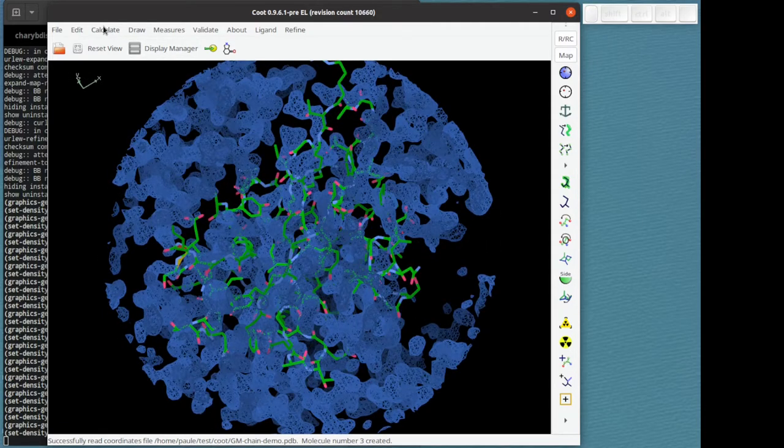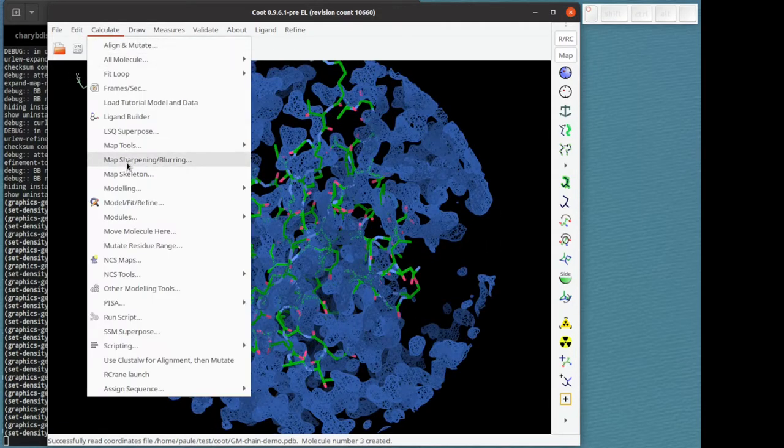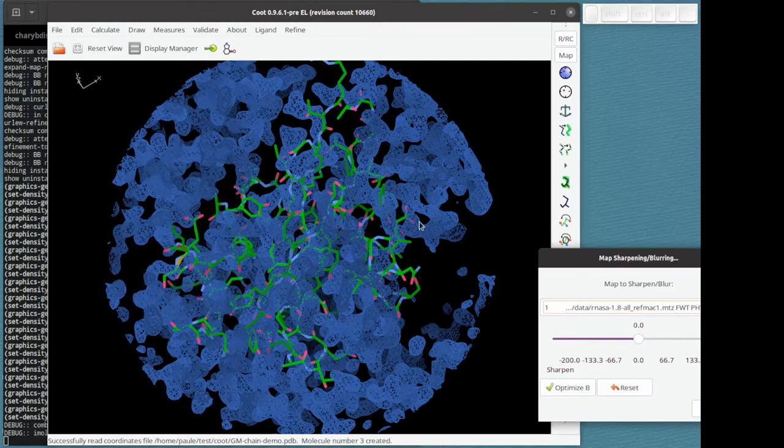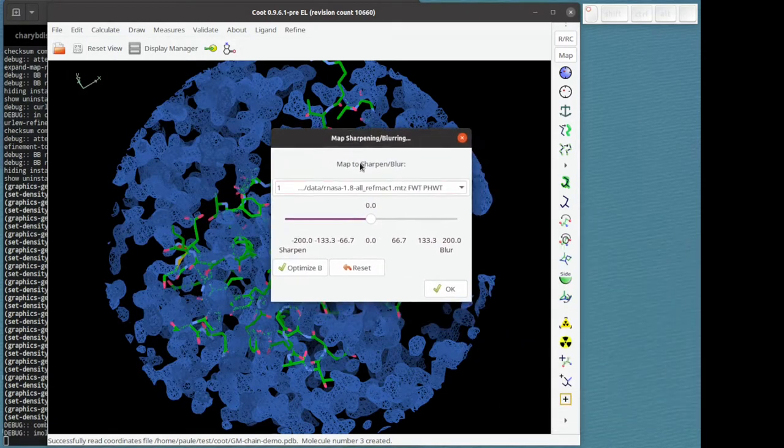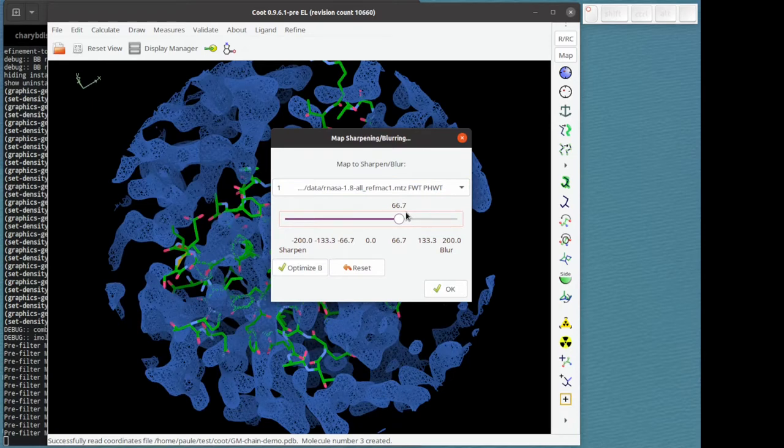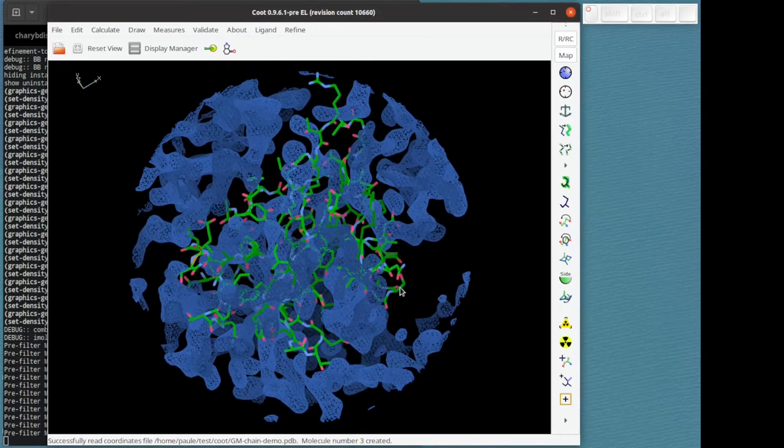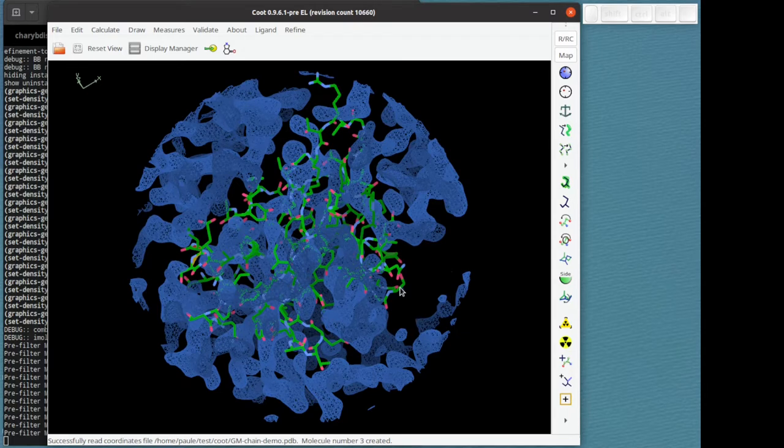What I'm going to do now is to change the sharpening of the map, well in fact the blurring, to 66.7. The way the molecule moves depends on that blurring factor. You might like to try different values later on.